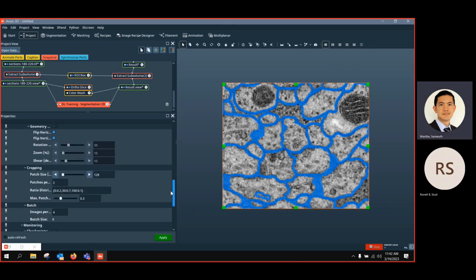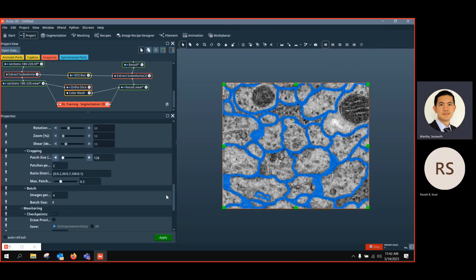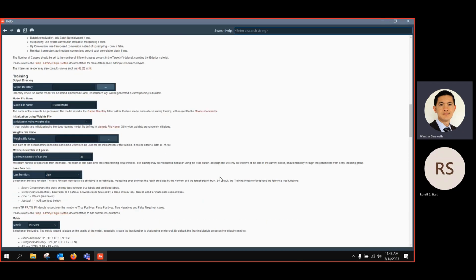Training in 3D is going to be much longer and needs more memory, RAM resources, and also CPU resources as well. And there are some ratios, so it's not very easy to explain, but I can look quickly here.